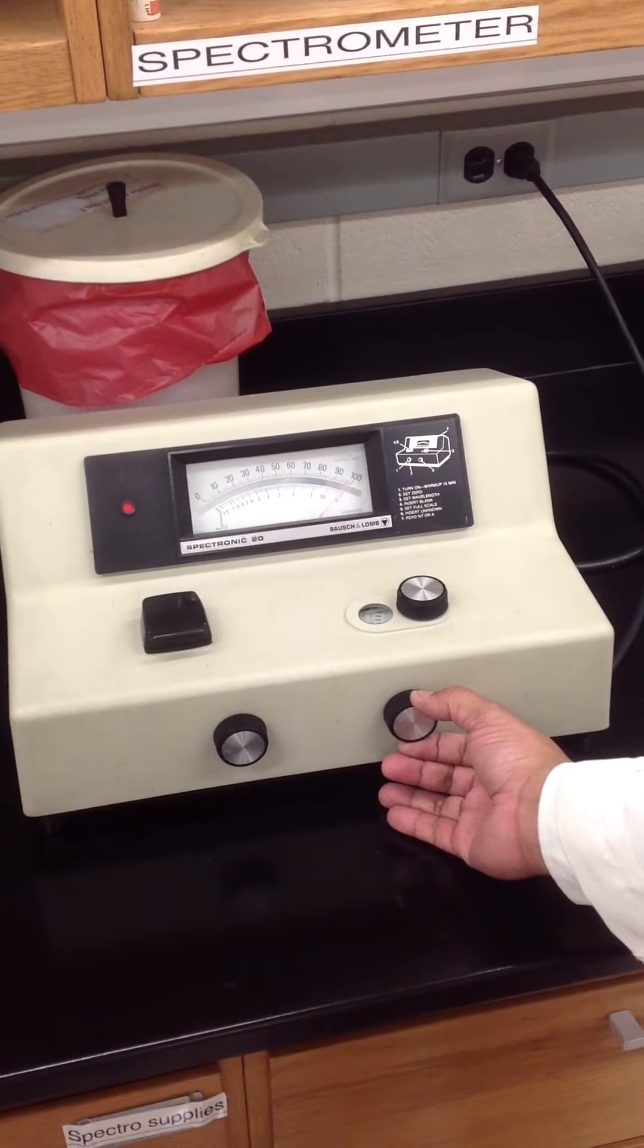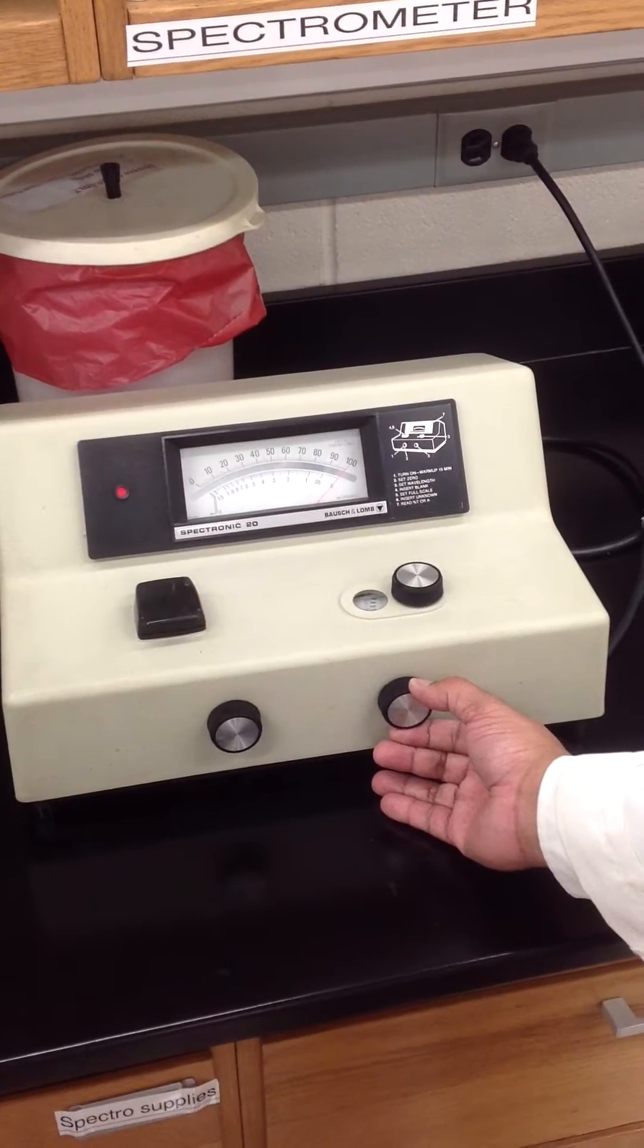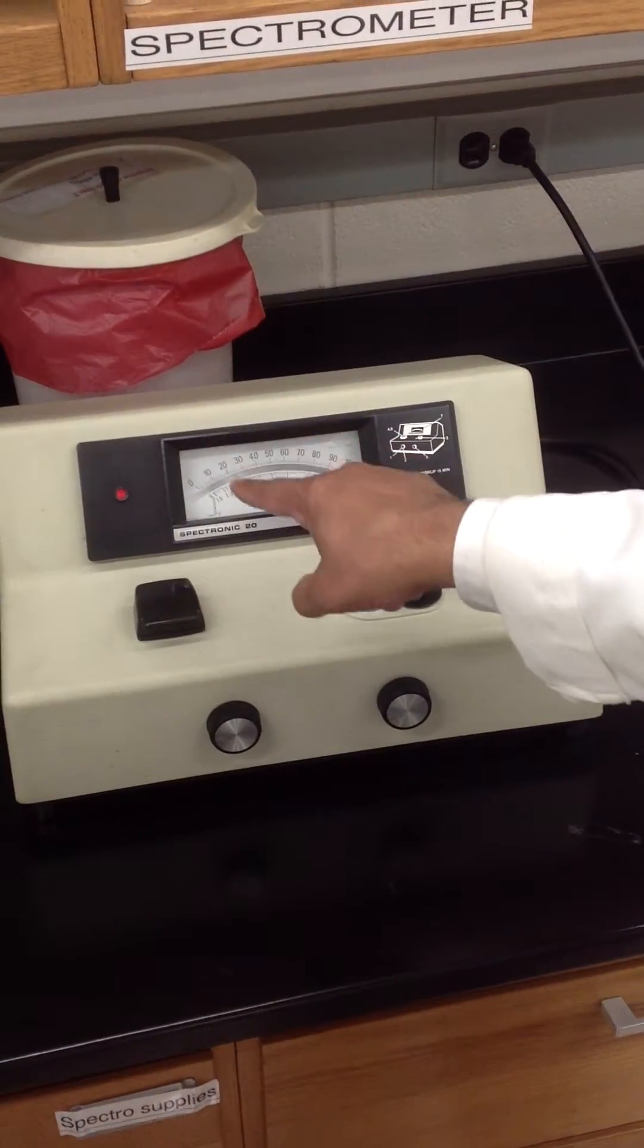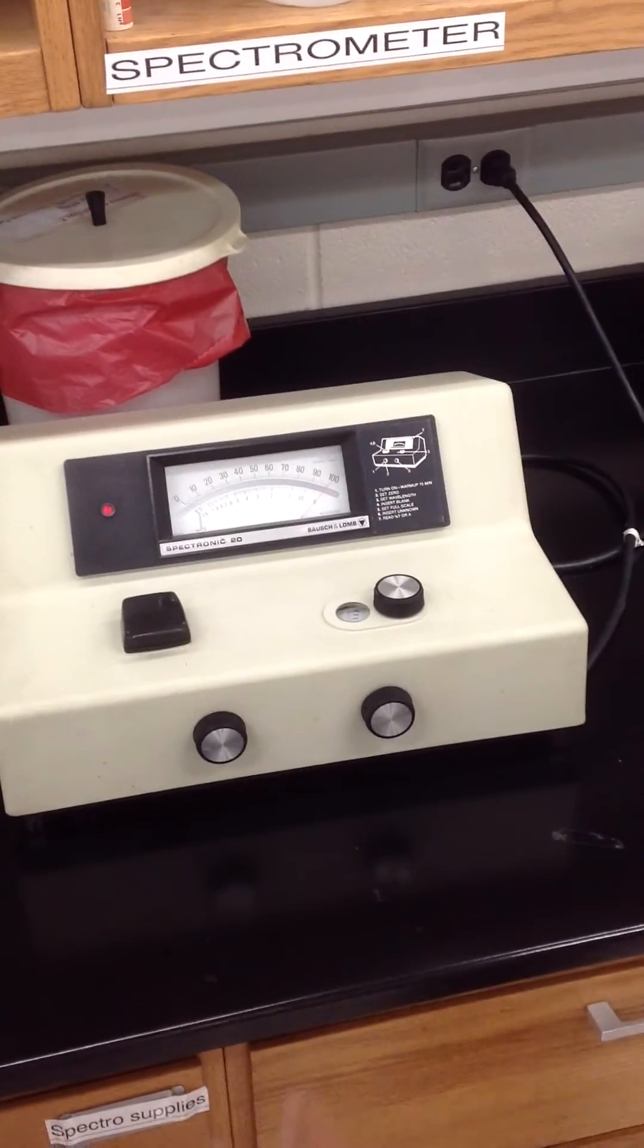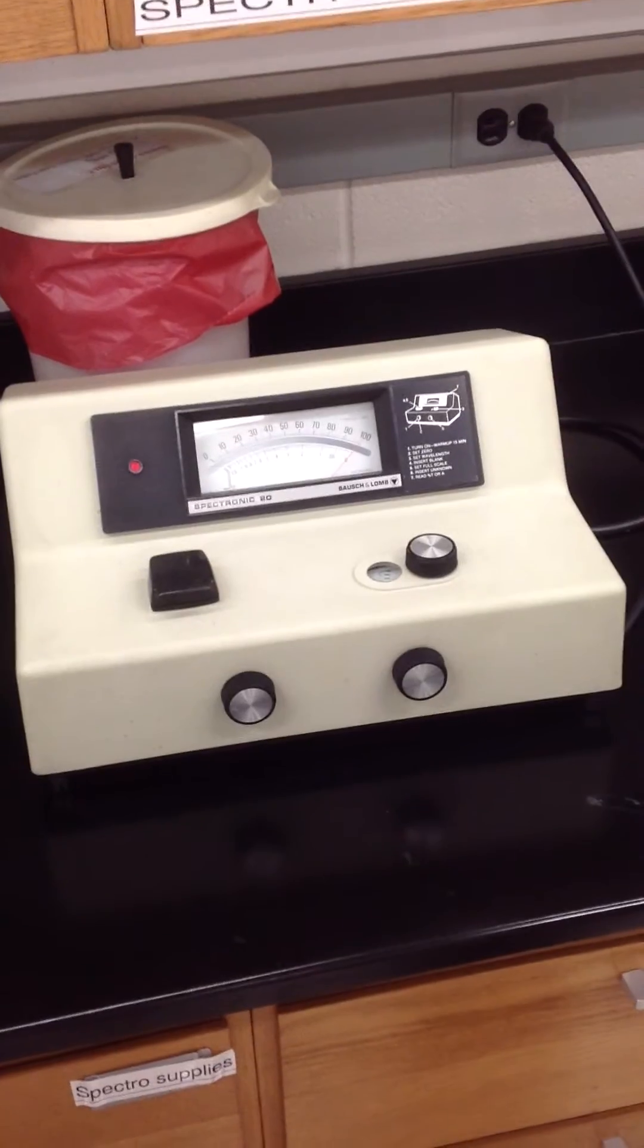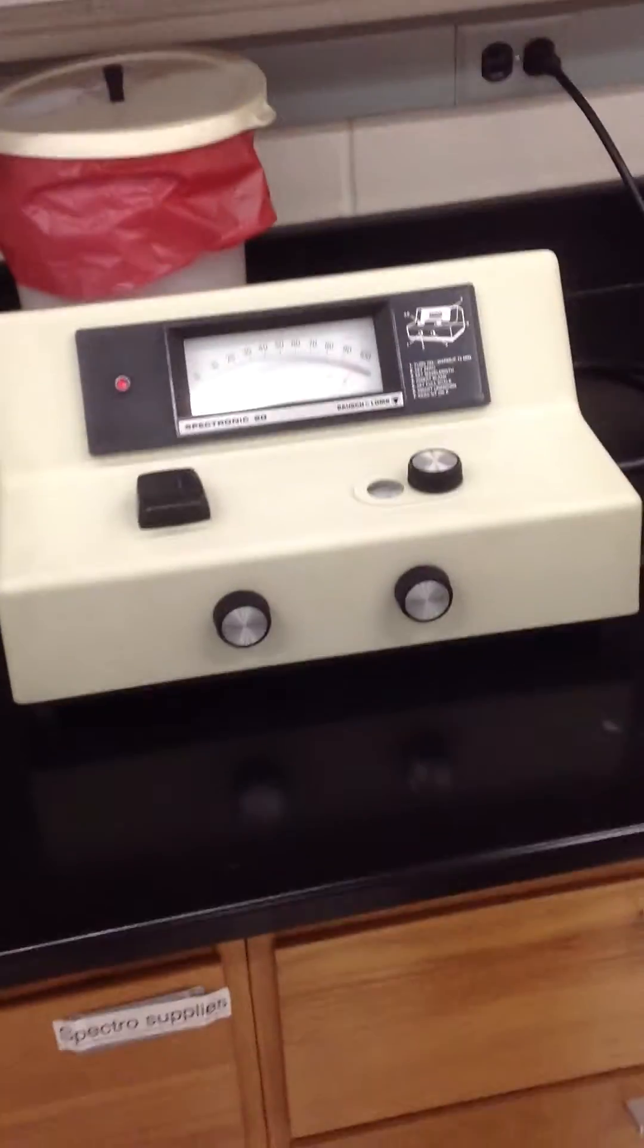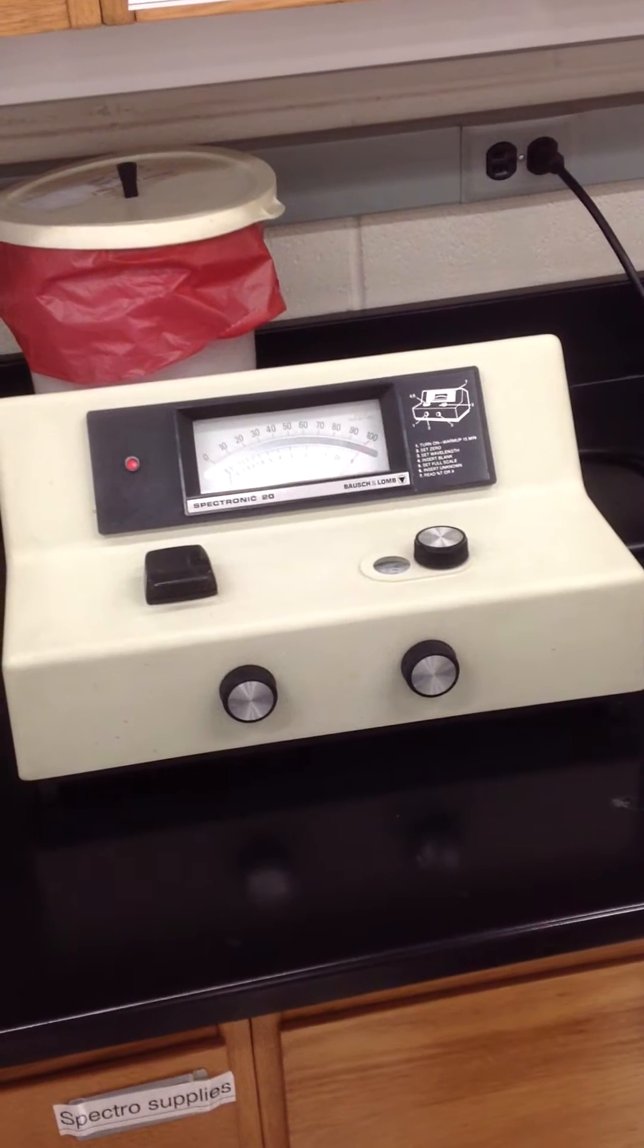So when you put it, you want to start full scale and we're using the lower scale. That's the absorbent scale. The upper scale is the transmittance scale. So if you're trying to do it with this, forget it. So that's not how it works.